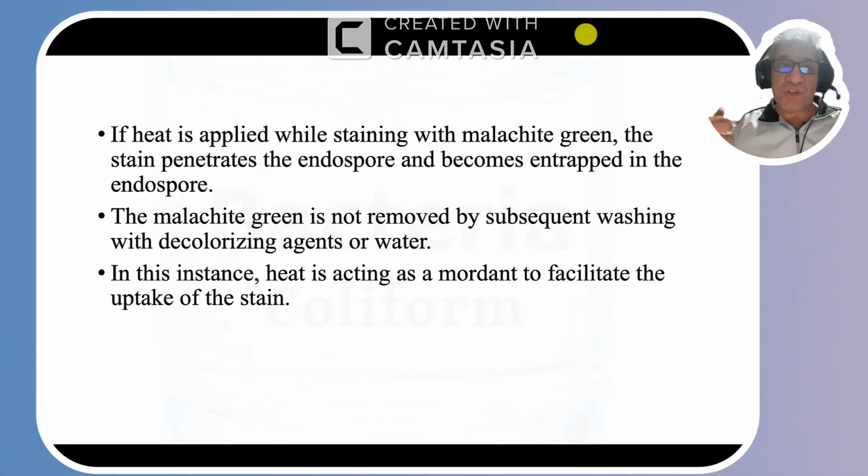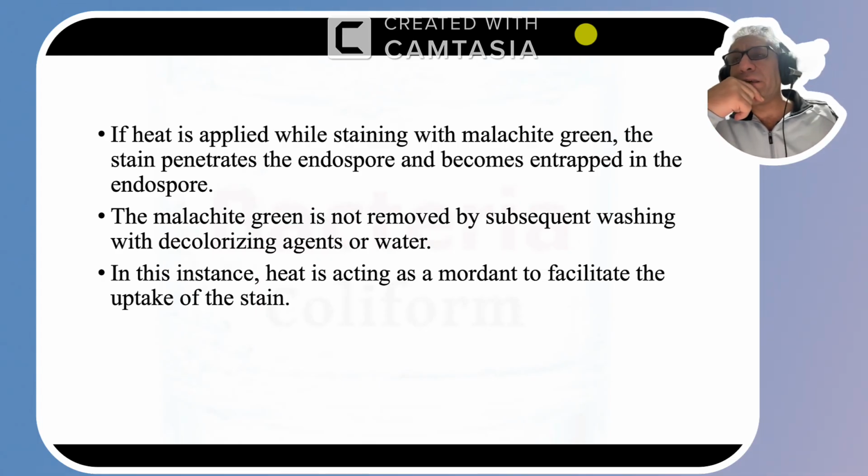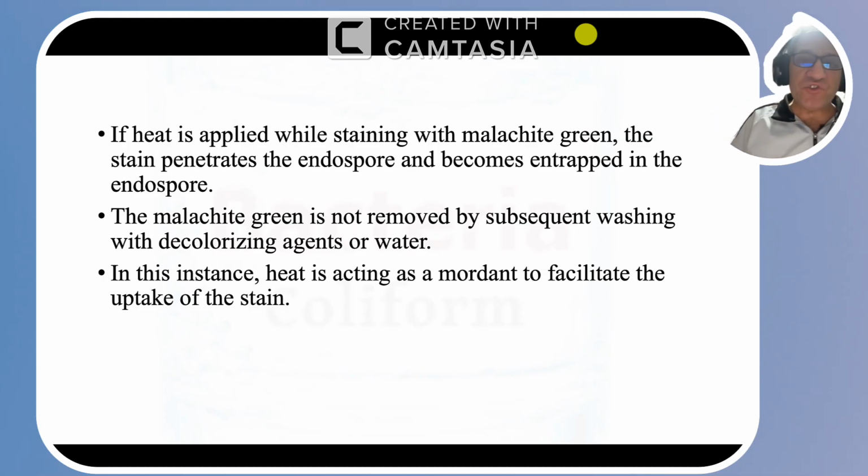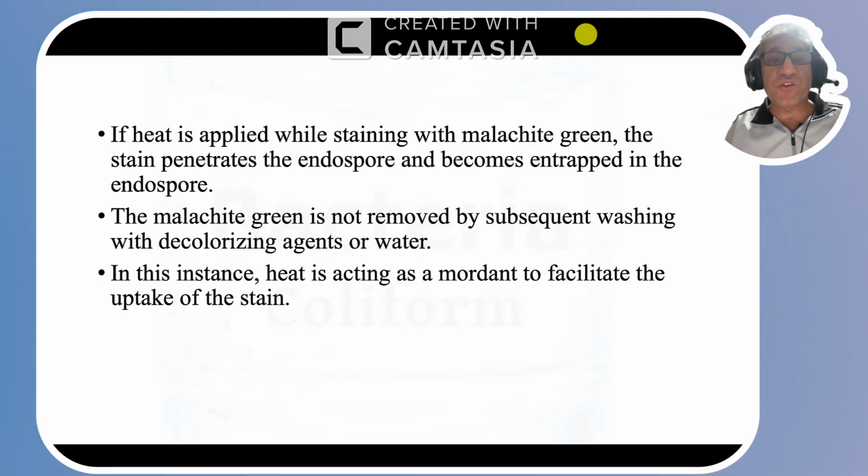The malachite green will penetrate the endospore and become entrapped in it. This malachite green is not removed later by washing, decolorizing agent, or water. It will stay green.